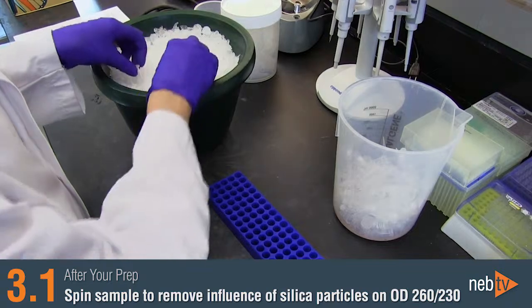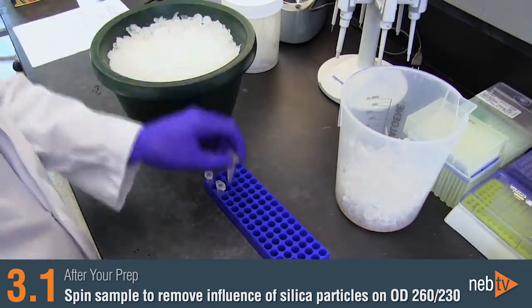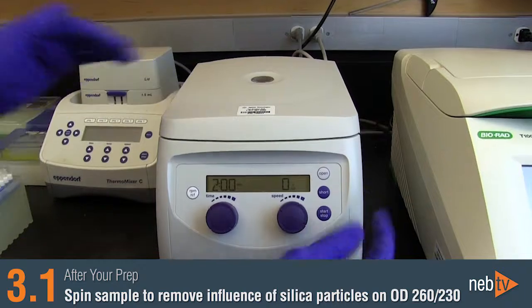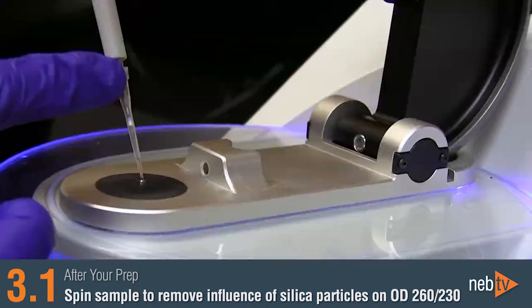In some cases, silica particles from the column matrix can be found in your eluate. To ensure that this doesn't affect your OD 260/230 ratio, you can centrifuge the eluate for 1 to 2 minutes at 16,000 times g and pipette the aliquot from the top of the liquid for measurement on a spectrophotometer.